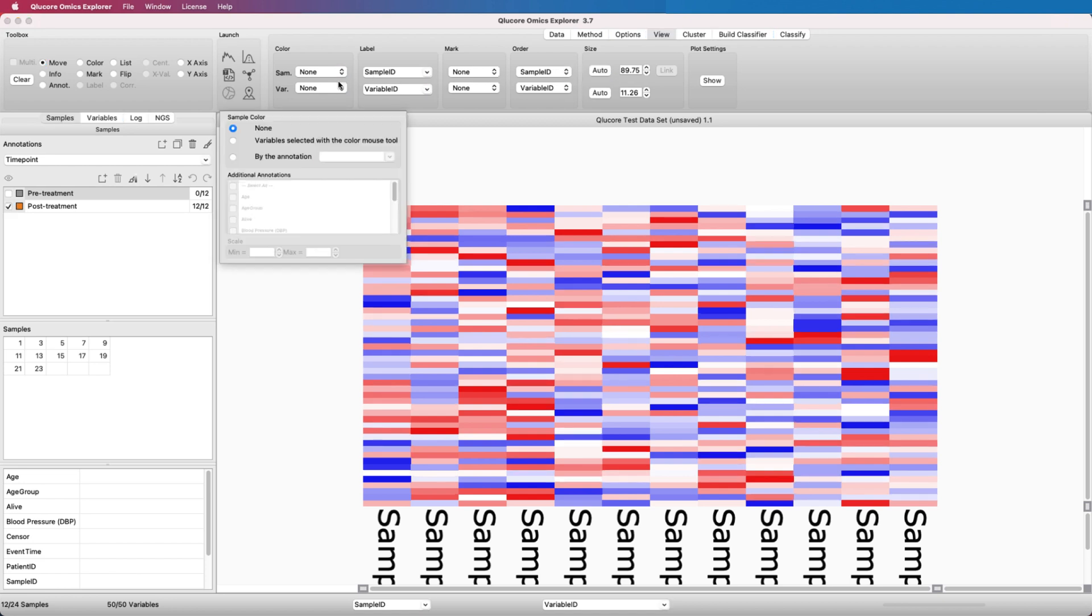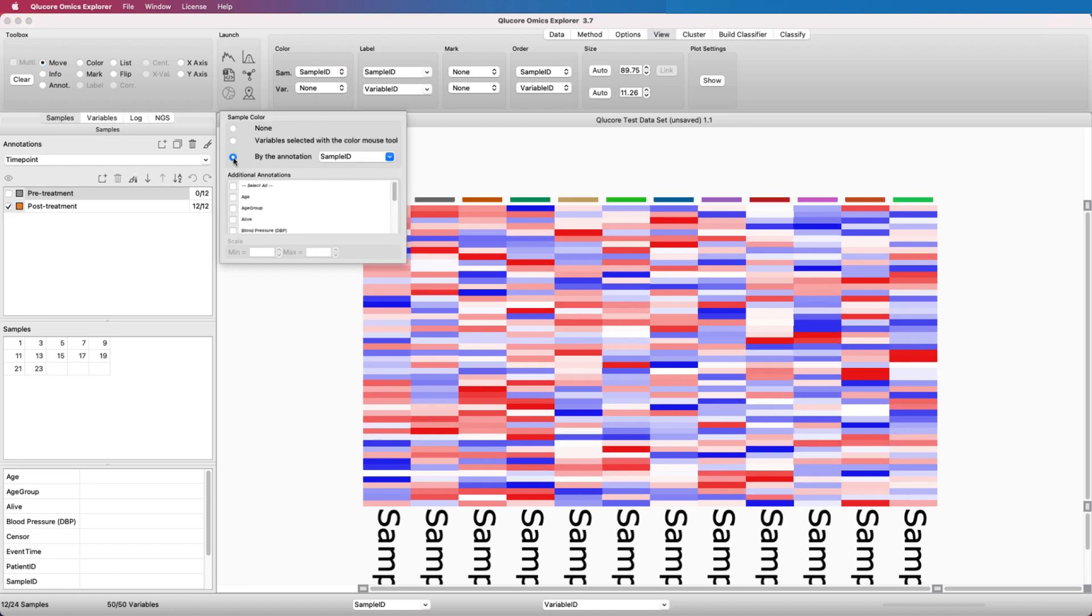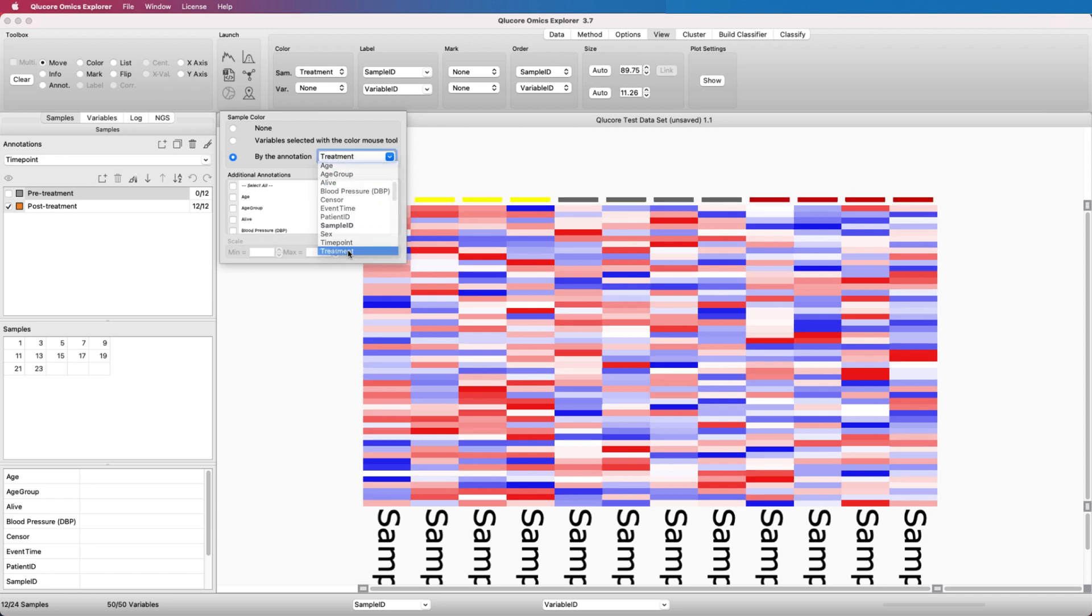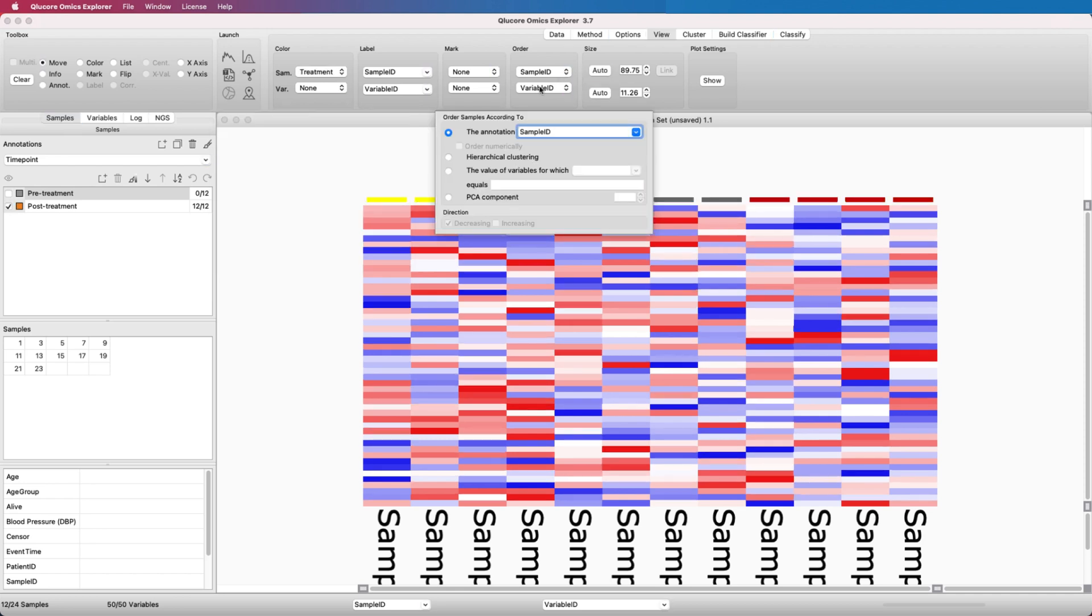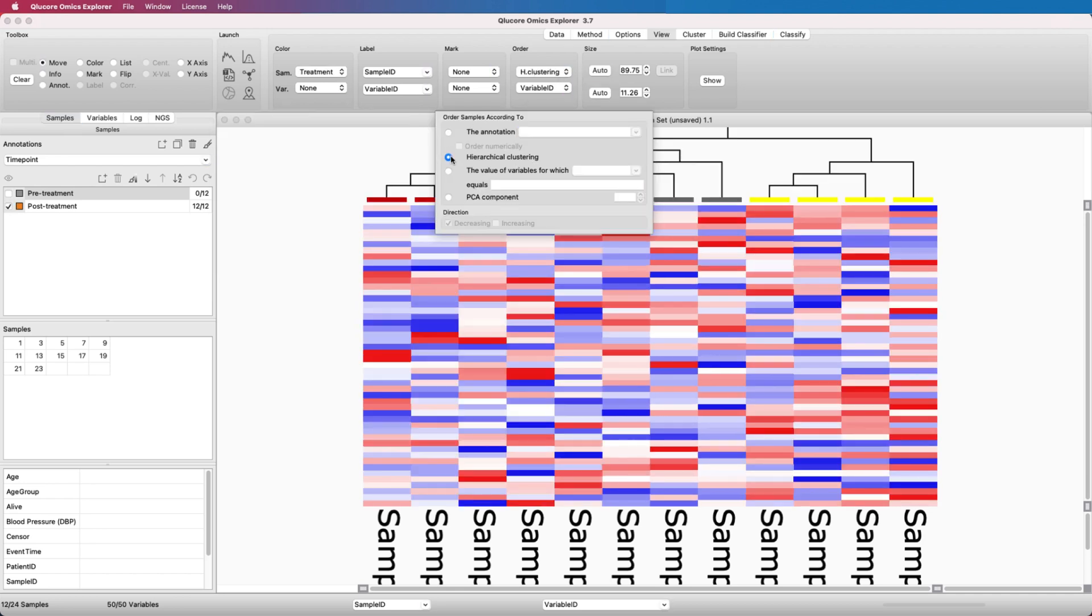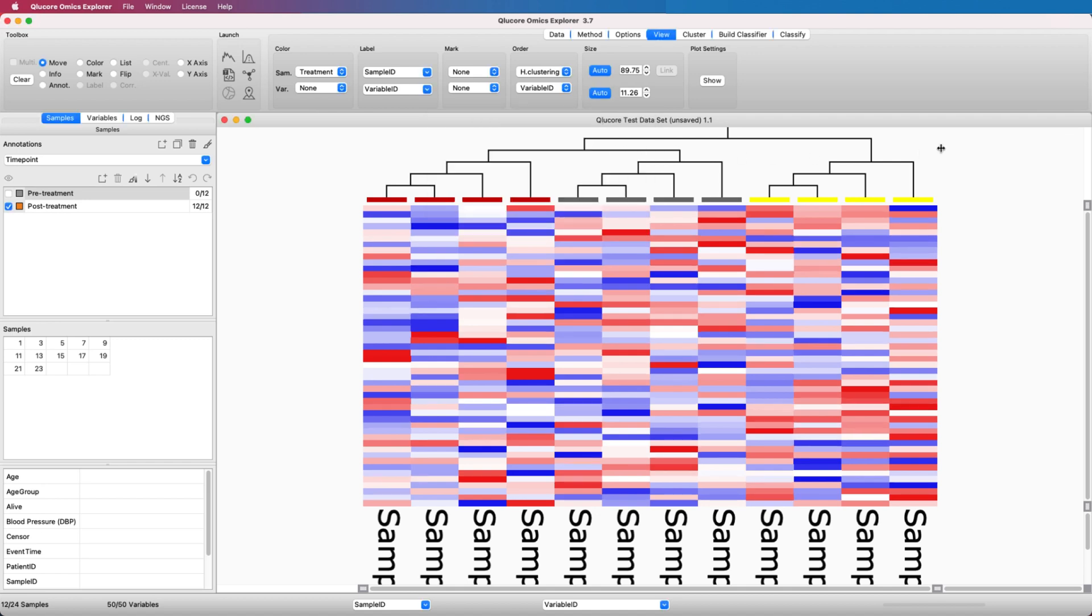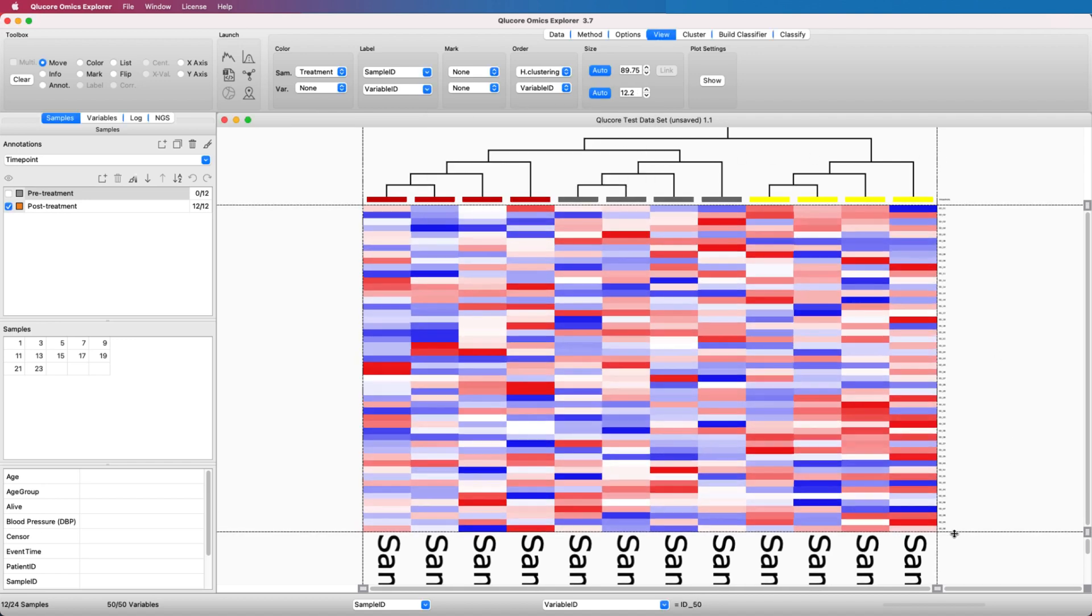Then we color the samples, the columns in the heatmap, according to the sample annotation treatment, and order them according to hierarchical clustering to be able to easily detect that the statistical test discriminates the groups as expected.